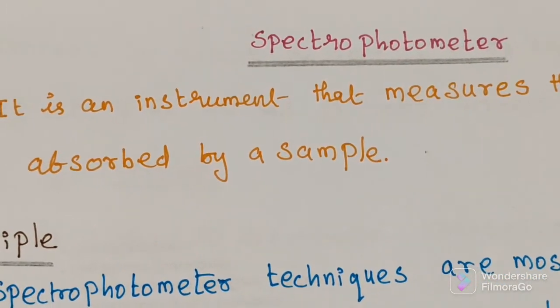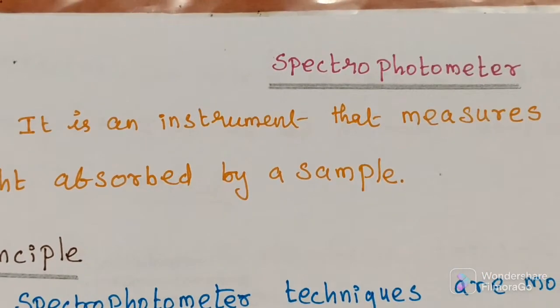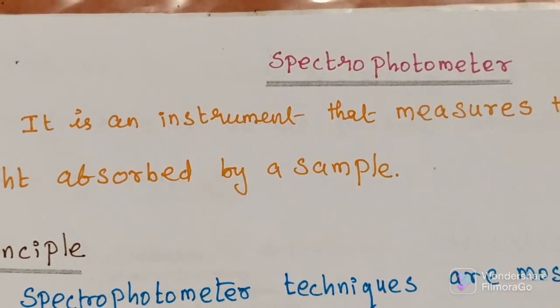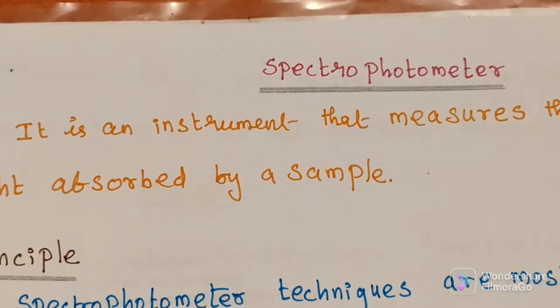In this video, we'll discuss the spectrophotometer. What is a spectrophotometer? This is an instrument commonly used in the laboratory. How do we define a spectrophotometer?